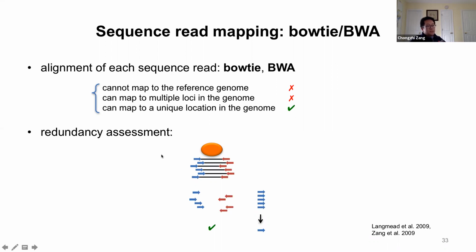All of the DNA fragments come from either sonication or micrococcal nuclease digestion that chops the chromatin and the DNA into fragments. Most likely, the sample DNA is from a large population of cells.